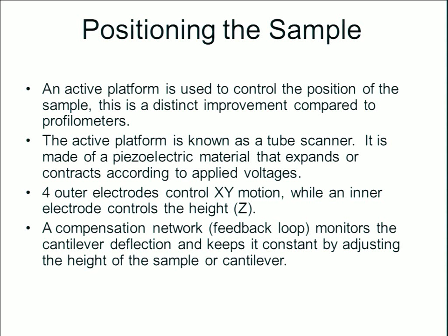And then there is a feedback loop or compensation network required to monitor the deflection and keep that deflection constant by adjusting the height of the sample or cantilever.